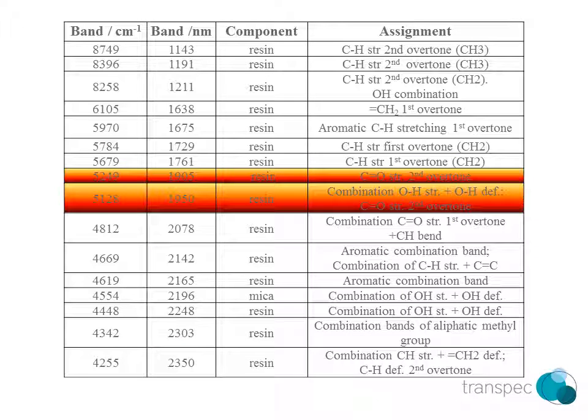The molecular peak shifts during degradation can be related to the carbonyl and carboxylic acid peaks. This gives information on what is happening in the degradation steps, and again is increasing knowledge.